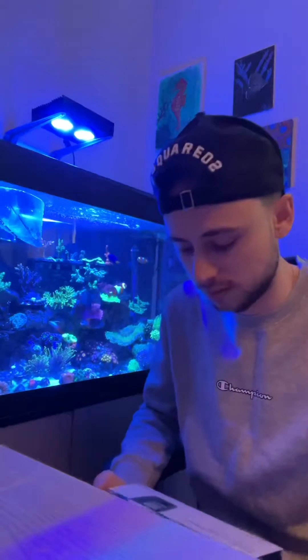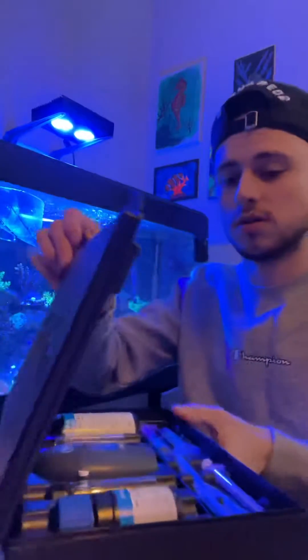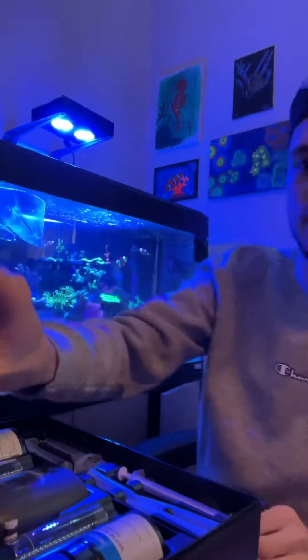So today I picked up the new magnesium Hanna checker. It's going to be a little unboxing and checking it against other magnesium checkers. So it's a two reagent kit. So let's get started.